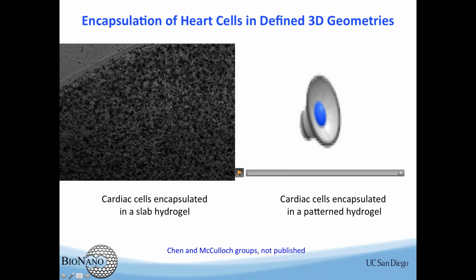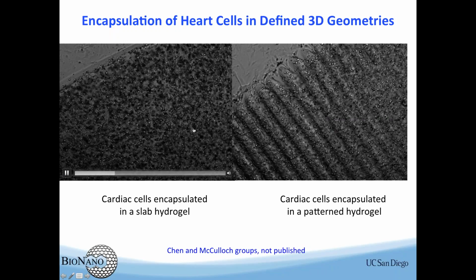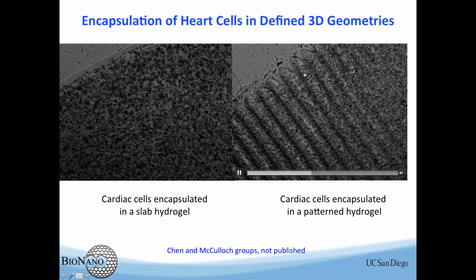Okay, so in this case, we just uniformly put cells there. You can see the beat, but if you do a little bit of engineering, by creating the pattern, or lining up these cells, you can see an immediate difference between this case and the other case. So in this case, these cells are better organized. They have synergy. They talk to each other better, and they beat differently.